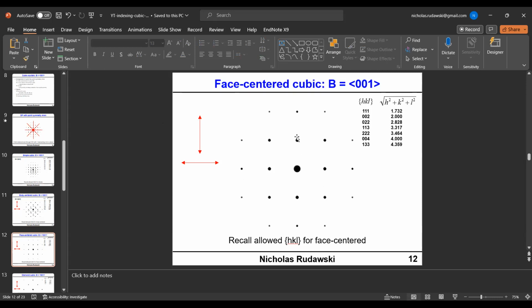Again, you can take my word for it, right? I have 4 mm symmetry. These are perpendicular, and these are the same length, okay? I'm not going to measure it. You can go ahead and do that yourselves.